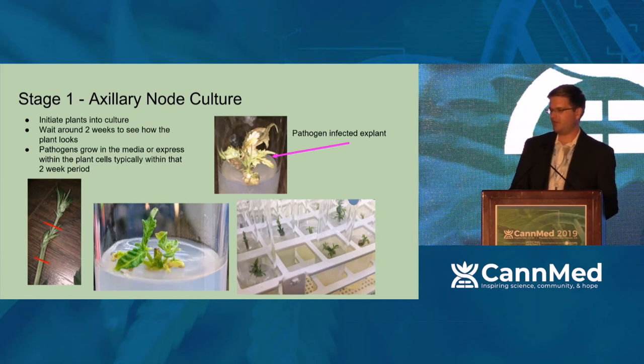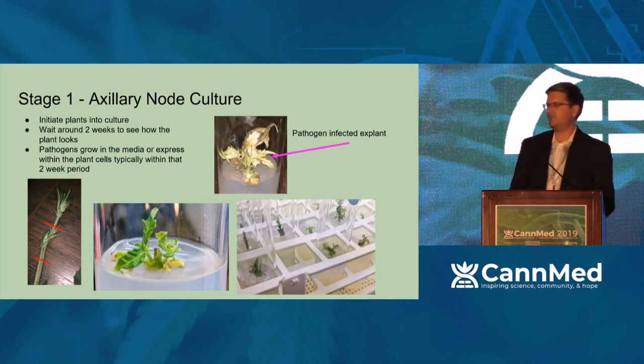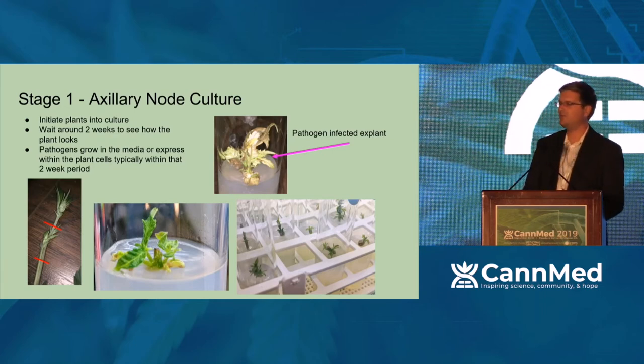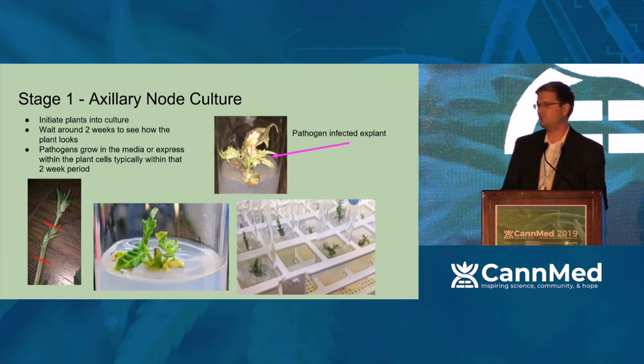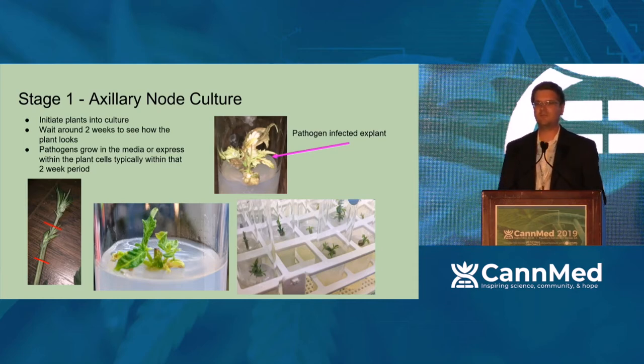At this point in time, you can see the plant that was infected by a pathogen, and those pathogens can create huge issues. I've heard quite a few presenters here talk about endophytes, and that's exactly what the majority of them are. You have endophytes or bacteria living inside your cell wall that pop out into your media about 2 weeks after you've cultured. That's a huge problem.